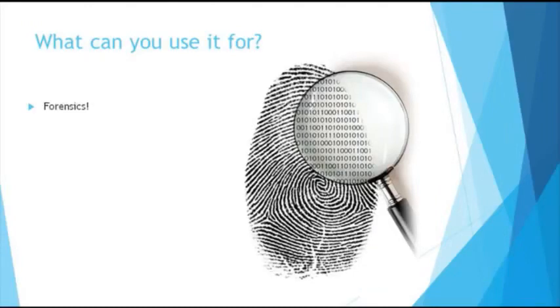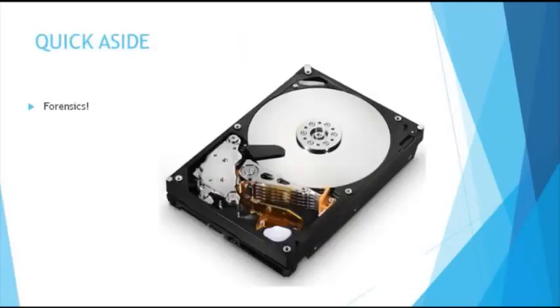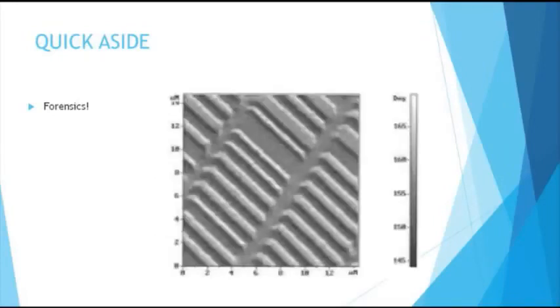One of the more interesting applications of this is in forensics. To dive very quickly into forensics, traditional hard drives are spinning platters, as you may have heard them called, and they're basically magnetic storage. Data is stored as ones and zeros on the magnetic drive. A one is magnetic and a zero isn't. So if you get an atomic force microscope and you magnetize the tip, you can start to measure the magnetism of something rather than the height of it. You can produce a picture of a hard drive like this. In this, the peaks are the ones and the troughs are the zeros. So you can measure very, very accurately the magnetism of specific areas.